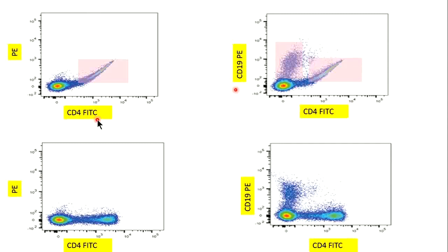So we apply the compensation, and you can see that after compensation this population comes down and you are having a straightforward population, meaning now you are not having any spectral overlap. So compensation is the daily routine of flow cytometry people, and if you are having 2 colors you can have the problem of compensation, but imagine you are having 8 colors, or 14 colors, or 18 colors, how difficult it will be, right?